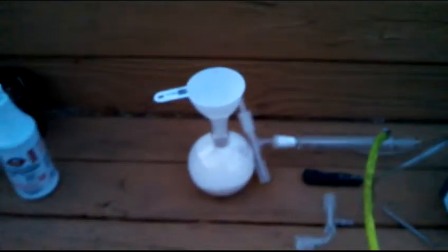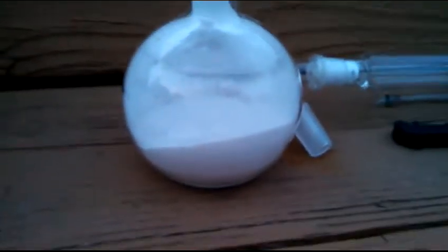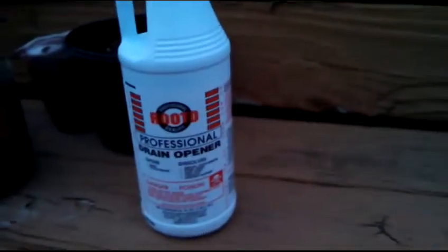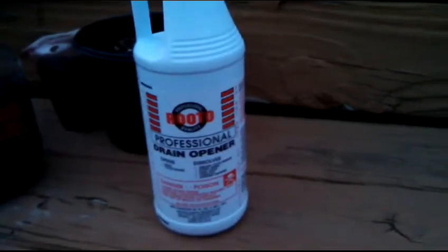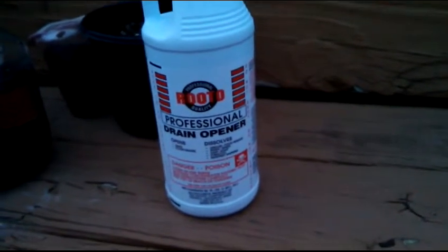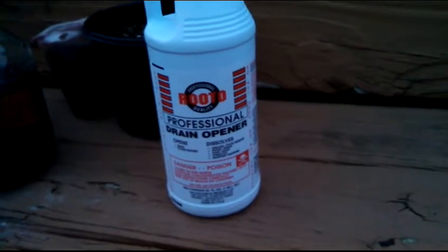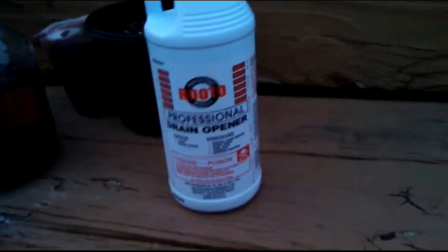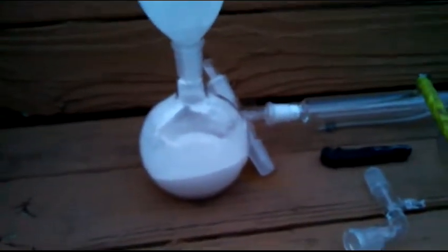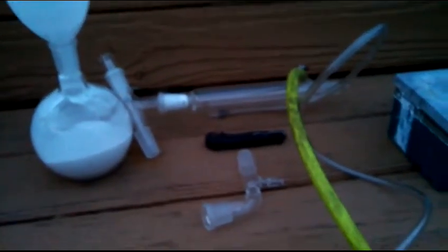Hey guys, I'm getting ready to make some nitric acid. I've got about 400 grams of potassium nitrate stump remover and I'm gonna put in about 300 grams of Rooto professional drain opener sulfuric acid. Then I will distill it. This is gonna be for my gold processing.